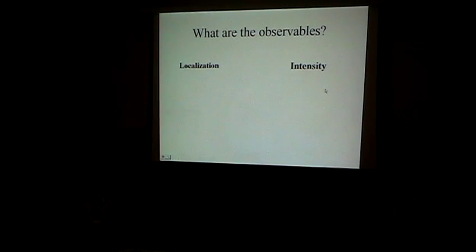Another way is to measure the intensity fluctuations of a molecule. And fluorescence is a very sensitive measure of the local environment, so this can give you a lot of extra information. A fluorescent molecule is also a dipole emitter.